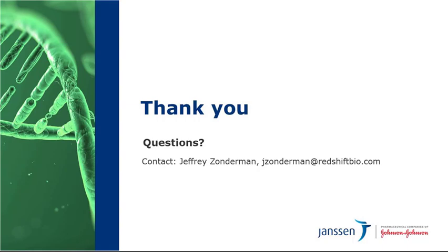Yep. And another VI question for you. Lou says, generally as part of the VI studies, we apply mixing at a defined mixing rate. Is this capability possible within the cuvette during measuring? That's an interesting question. It's something that has come up in discussions we've had with various groups.